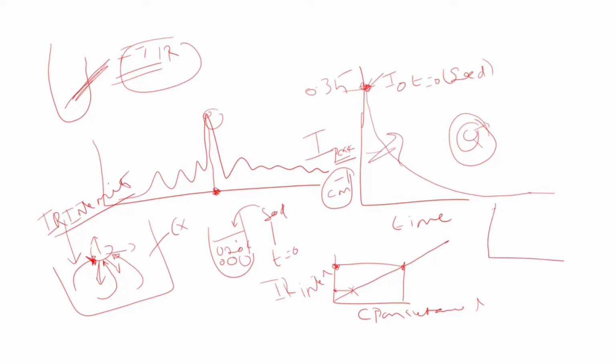So imagine you start from 0.35, it will come down like this, and then it reaches some constant, which means your solution reached the saturation concentration, or in other words, all your supersaturation is consumed. So we start at a supersaturation ratio of 1.2. By this time your supersaturation will be equal to 1.